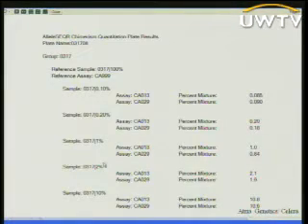This is again another readout, a slide from the company, where they're looking at input DNA based on their own calculations, two different markers that were used in the assay, and then what the program calculates for you as being the percentage of this minor component in the mix. As you can see, the two markers give you pretty close results, and the results are very similar to what was calculated as being should be there. And again, the nifty thing about this program is that it's a click of a button. You run the program and you hit calculate, and it basically does it for you and spits out the result, which is very attractive since the STR analysis can be so cumbersome.